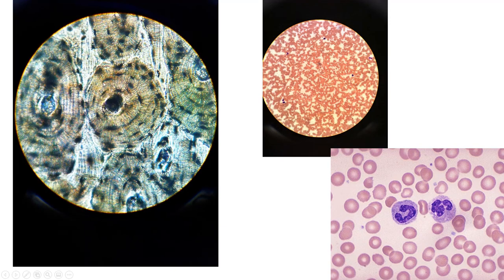This is compact bone. It looks like concentric rings. So, compact bone. These are osteocytes lying in spaces called lacunae.